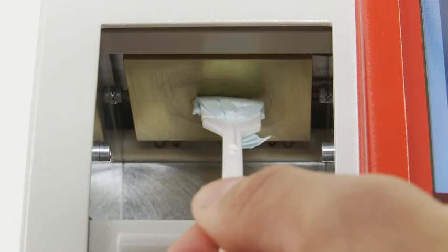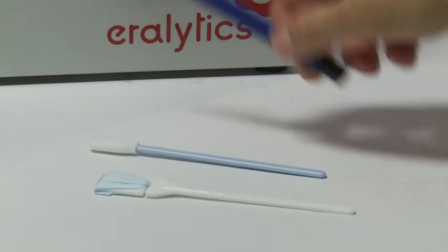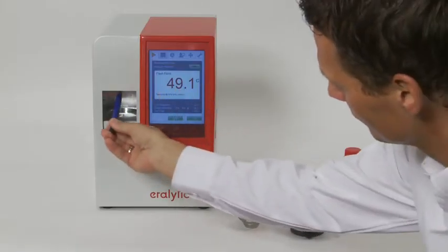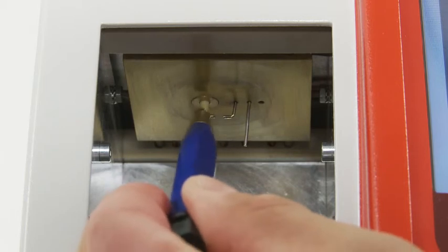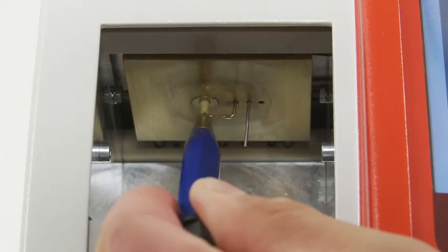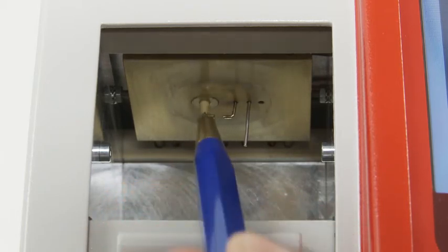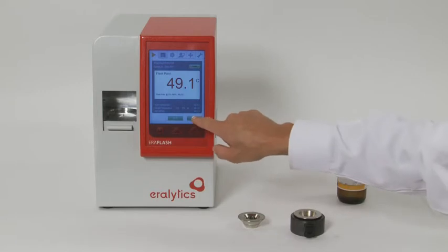If there is some solid residue remaining on the electrodes, brush them with the brass eraser. Now the instrument is ready for the next test.